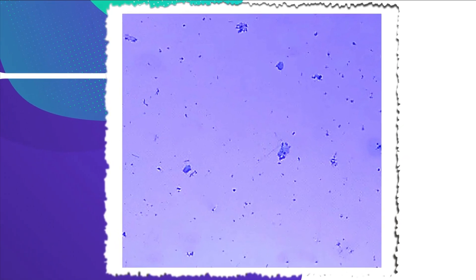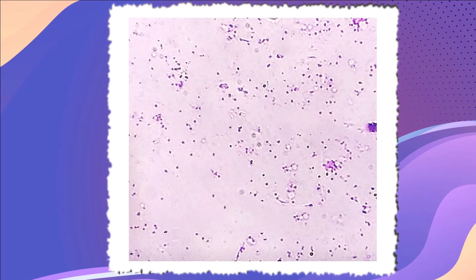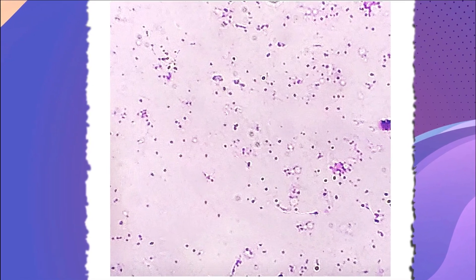We already observed our plant cells under the microscope before. Now let's see how animal cells look like under the microscope. This is cheek cell under the microscope at 40 times magnification. This is cheek cell under the microscope at 100 times magnification. This is how bacteria looks like under the microscope at 400 times magnification. The bacteria is circular shape and it is stained in purple.